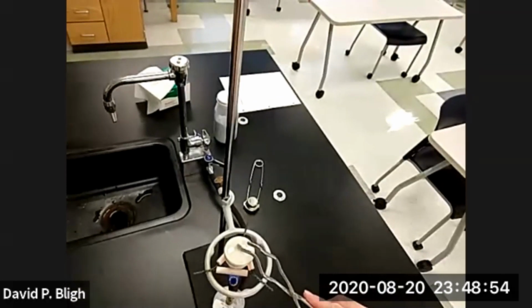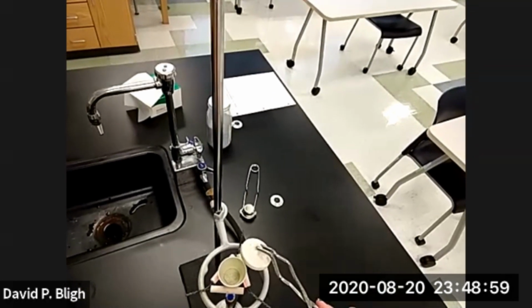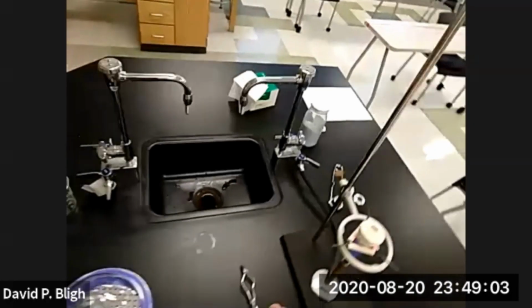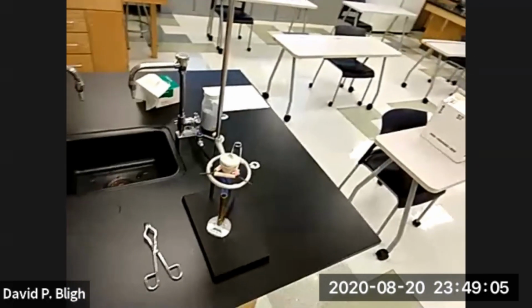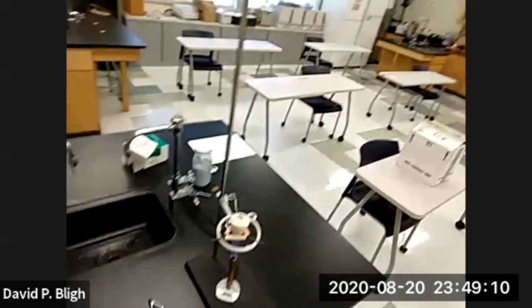Let's see, we're coming up on 5 minutes. Let's take a quick look at our material. Oh yeah, it's getting there. Now, the nice thing about copper sulfate hydrate is it has a very wide range of response to temperature.